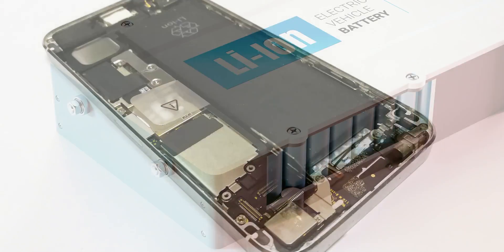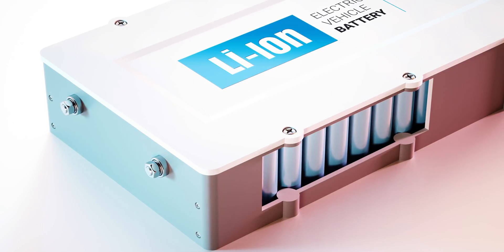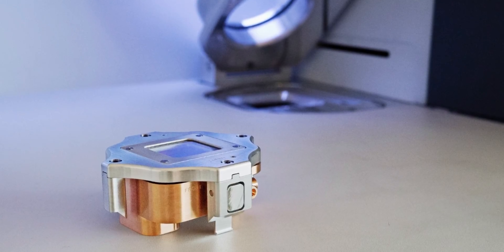There are a couple of key challenges in analyzing lithium-ion battery materials. Firstly, the materials can be sensitive to air. This means that even before they've entered the system, any exposure to air can change their chemistry. With NEXA, we also have a vacuum transfer module. This can be loaded with samples inside a glove box and then transported directly into the system without exposure to air.